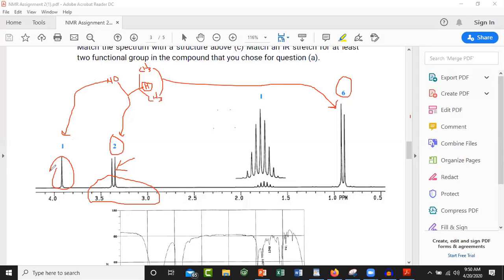All right. Now this signal right here, this proton. What do you think? Yeah, it's gonna be the last one because it has 6 neighboring. Well, does it have 6 or 8? It has 7 neighboring, but isn't it 1 + 1? So 8. Well, it's got 3 here, right? 8 neighbors. 3 here, and then on this carbon, that's a CH2.